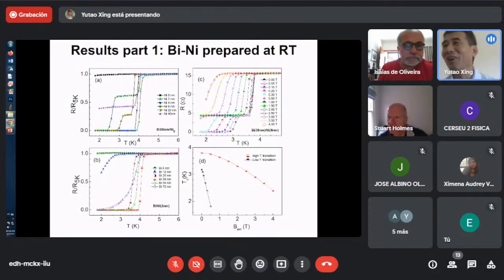Yes. To be honest, when I was trying to do the thin films, one sample I got, all of them, they are nanowires. So I didn't show it here because I didn't publish it yet. I'm thinking that they must be nickel bismuth 3 nanowires. It's not pure bismuth because at the end we deposit a nickel layer. But I'm not so sure. I didn't do the transport study because at that time we didn't have the FIB installed. I cannot make the nano contacts.